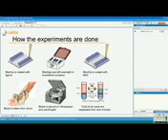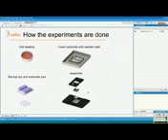A typical leukocyte experiment running on the VenaFlux platform consists of the following steps. First, we coat the biochips with a specified ligand. It could be VCAM, ICAM, or selectin. Then they are kept within a humidified chamber overnight. Prior to the experiment, we coat the biochip with BSA to block non-specific binding. We can use a cell line sample or blood taken from a donor, and then we can isolate a certain cell type from that blood.